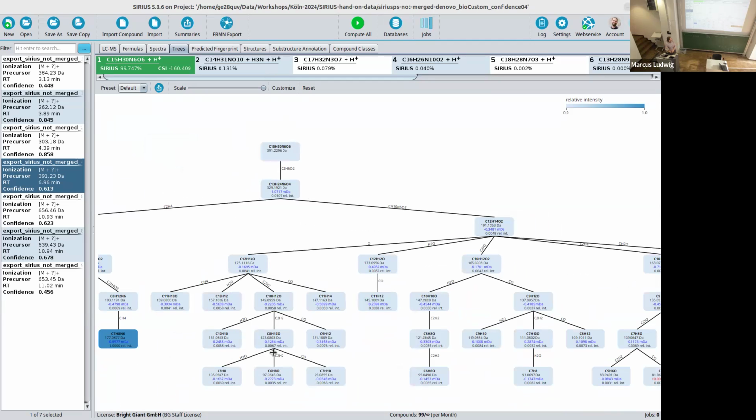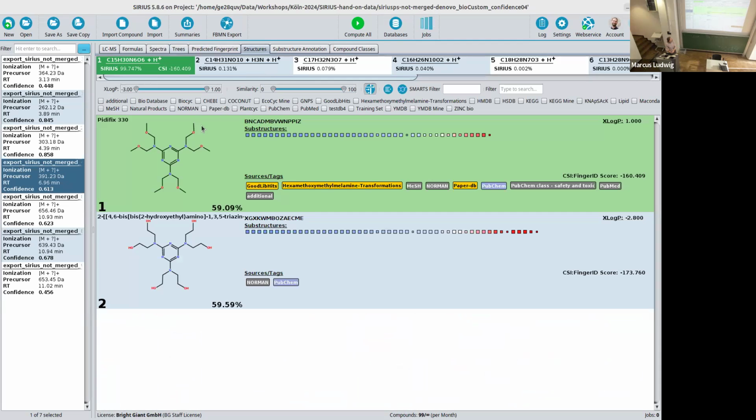Maybe there are also just some rearrangements that produce this. Maybe that makes complete sense because these tails here are doing something. I don't know. So this is basically just an idea of how to look at the data, and now you can use your expert knowledge to make sense of it, or say in the end, this is not a correct annotation. For that, we have all these ways to leverage this knowledge.